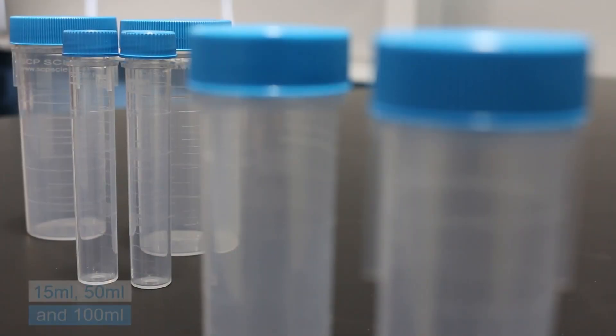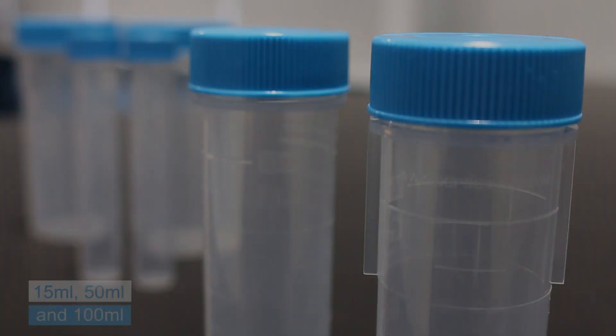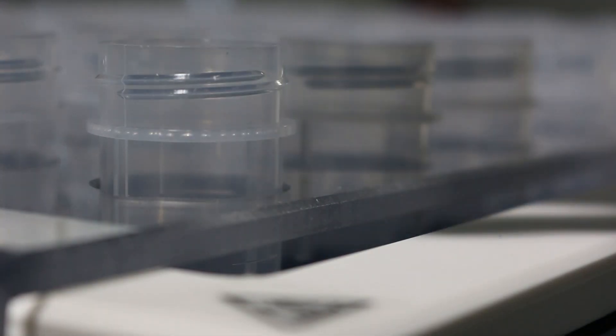Digitubes are available in various sizes, all with optional rack lock. This allows the user to easily close the screw cap.